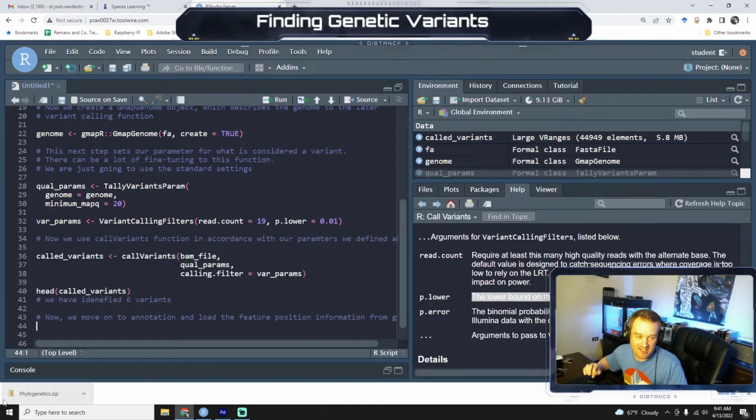If you mutate in an intron or an intergenic region that doesn't code for a protein, there can be selective pressure because you can have transcription factor binding sites and things like that. But for the most part, there's not as much pressure where that organism might die from that mutation. So we want to map these SNPs to see if they're in genes, because those are what we're more interested in.